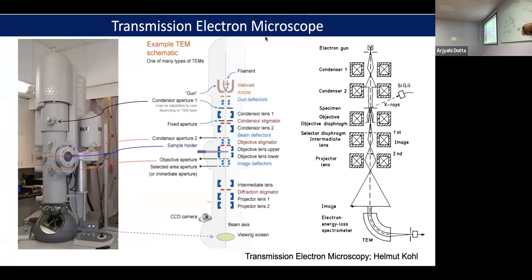Right? Why do we need this electron microscope? Why do we need to make this complicated? We can just use the simple light microscope and add more and more lenses. We'll make a microscope like a 3-story building. We'll just put lenses and magnify everything. And at the end, if you have graphene, you can see all the carbon atoms if you just gradually magnify it.